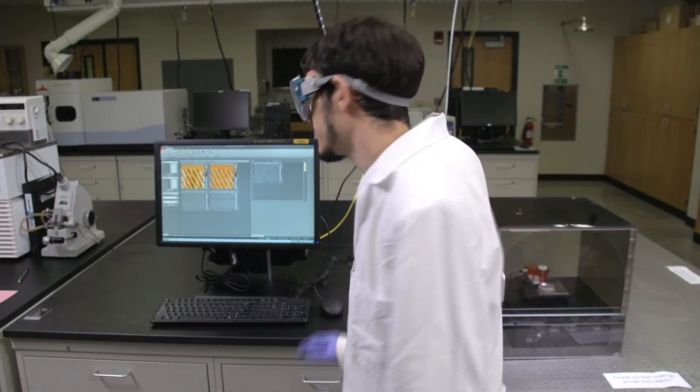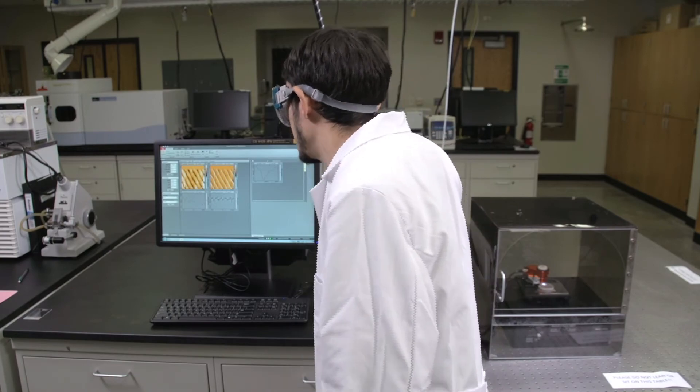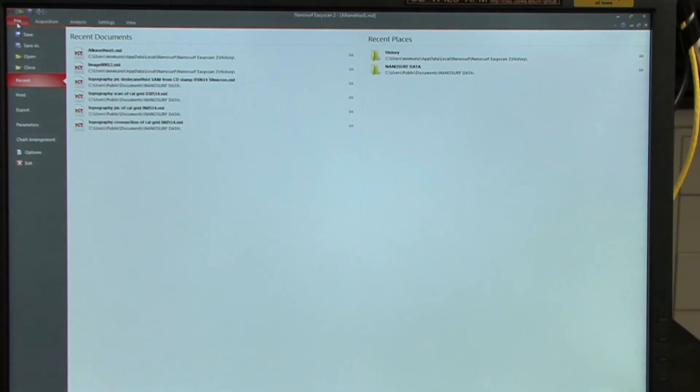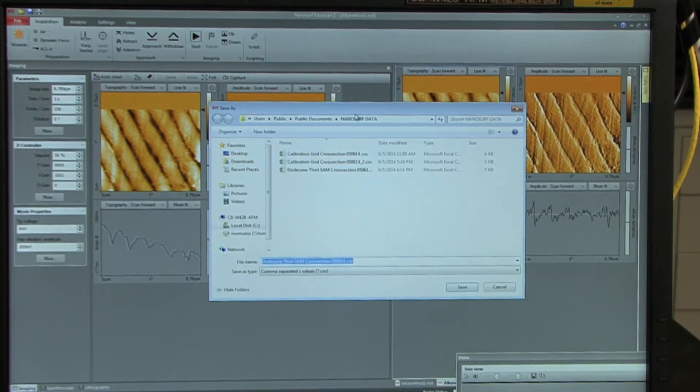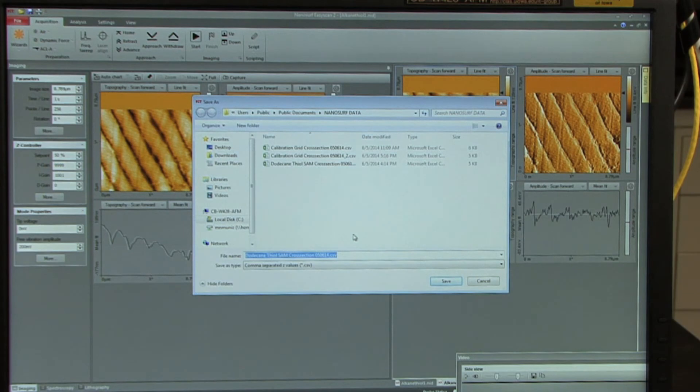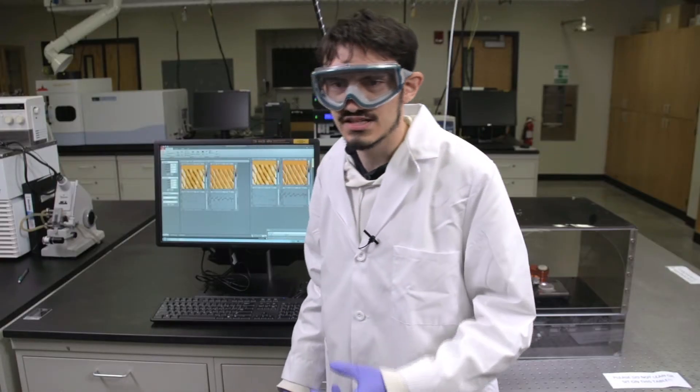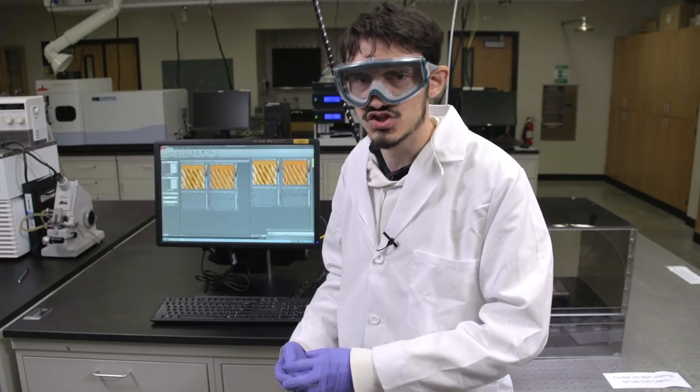Additionally, you can export the raw data as a CSV file by going to file, export, export current chart, and you'll see the comma separated value, Z values come up. Save this in the appropriate public documents area, and then later export it to your individual H drive.